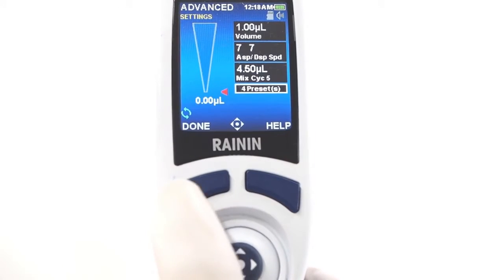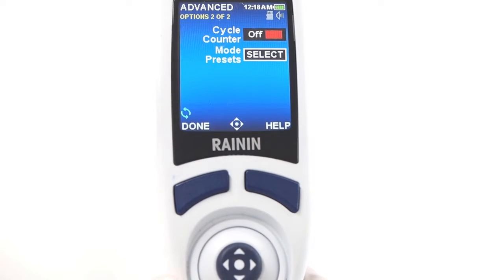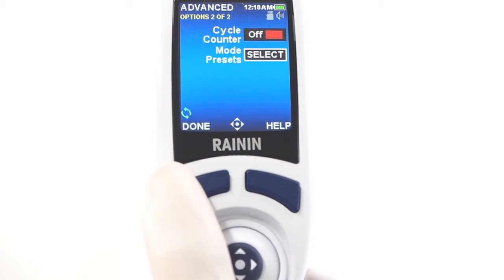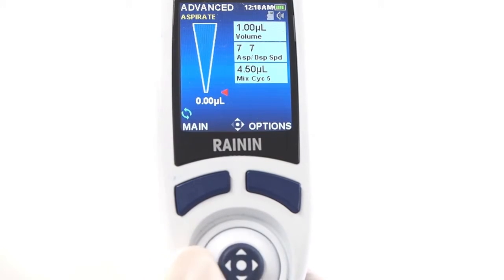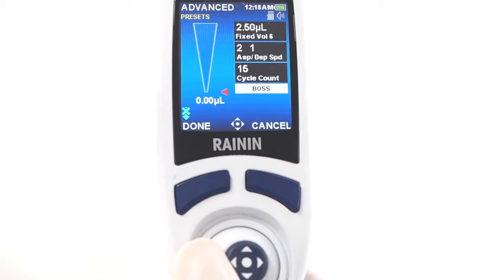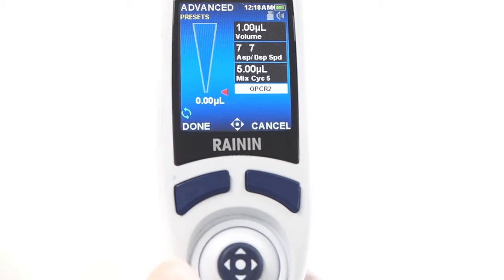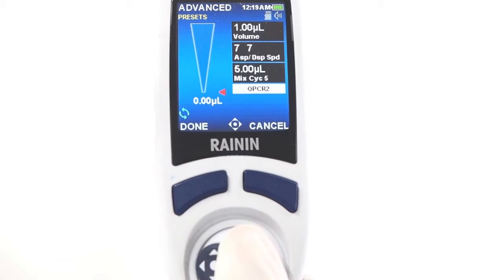Press done again to exit settings. Options also include mode presets, which give you a quick way to program a protocol. With any configuration of settings and options saved as a preset, you can glide between them, as shown here with the A preset, BOSS preset, and QPCR1 and QPCR2 presets. Notice how different the settings are from preset to preset.